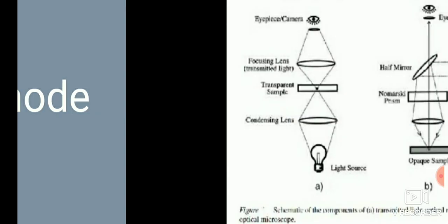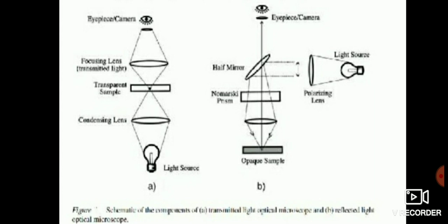Unlike the situation with transmitted light and semi-transparent phase specimens, the image created in reflected light DIC can often be interpreted as a true three-dimensional representation of the surface geometry, provided a clear distinction can be realized between raised and lowered regions in the specimen.